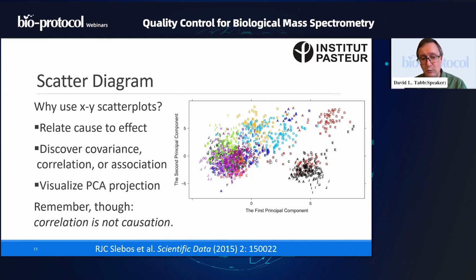But probably the most common use that we see for scatter diagrams in the quality control domain is that we want to visualize something from principal components analysis. Principal components analysis is very useful when we're trying to boil together a lot of different information from these experiments into a single axis. So in the case of the Vanderbilt instrument diagram at the right, the first principal component is the one that explains the most variance across all of these experiments. The second principal component is the one orthogonal to that, accounting for the second most variation overall. That's what principal components analysis gives us.